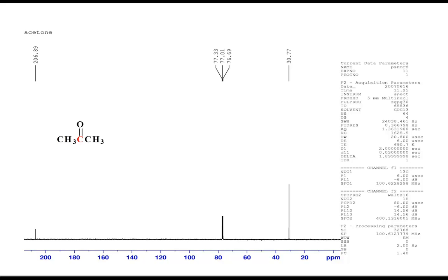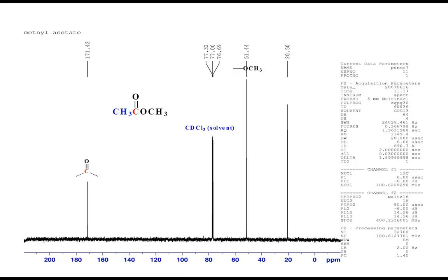These are some of the assigned structures, so you can just browse through all of them. As I said, if CDCl3 is seen in your spectra, just ignore it. Don't count that as a type of peak towards assignment of your structures. You would be misled and you would get a wrong structure. So pay attention to the solvent peaks and try to ignore them. We have tabulated values for solvents, and we tell you what solvent has been used, and you can ignore that particular peak.